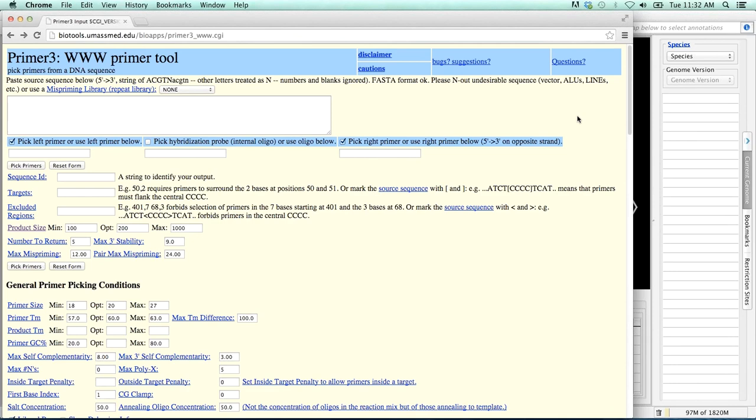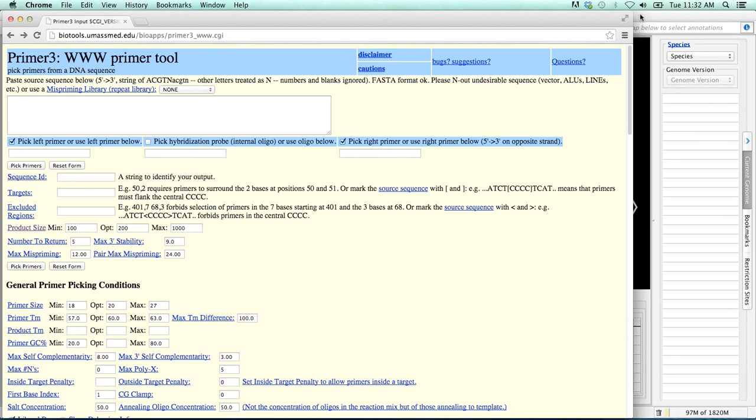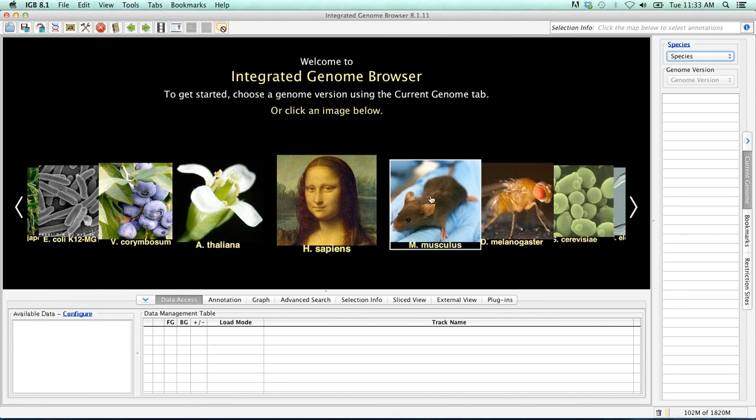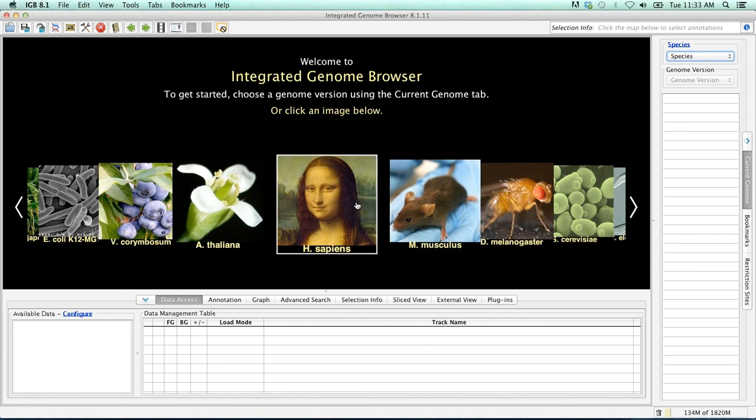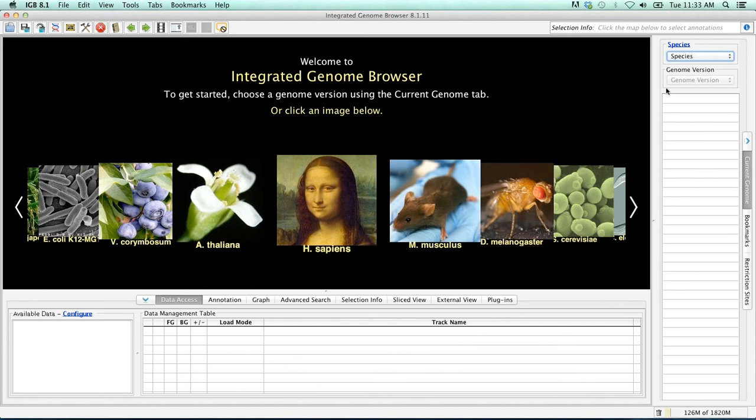Once installed, an IGBE icon should appear on the desktop and IGBE should open. If not, double click the icon to open IGBE. When IGBE opens, you'll be presented with a carousel showing many of the currently available genomes. This is the IGBE home screen, which can be accessed at any time by clicking on the blue species link in the upper right hand corner.